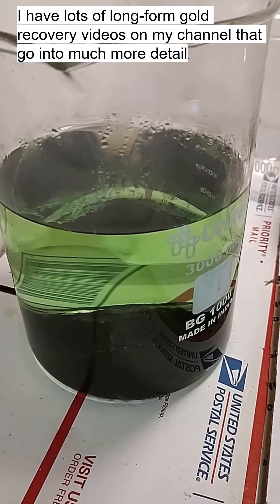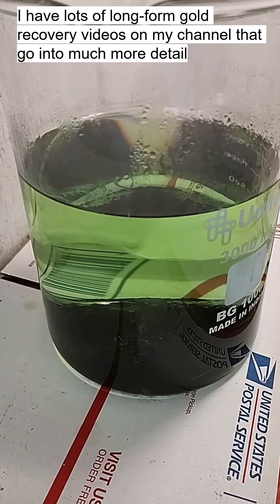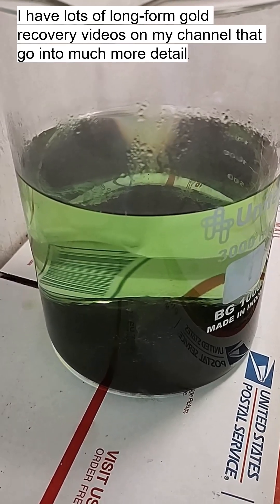And there's our gold — a nice thick layer of it on the bottom of the beaker. That's how you do a gold drop, folks.